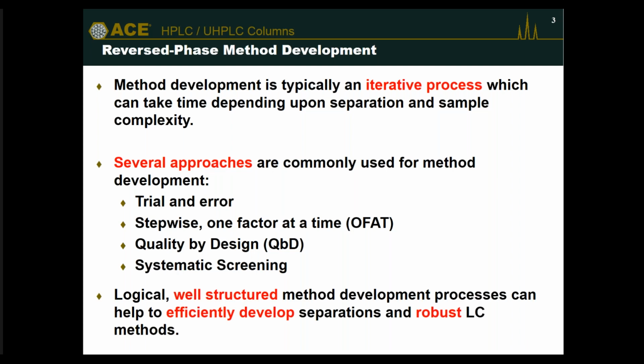And of course, logical and well-structured method development helps you develop your method far more productively. It also helps you understand something about the retention behavior of your analytes. So method development really is the exciting part of chromatography.